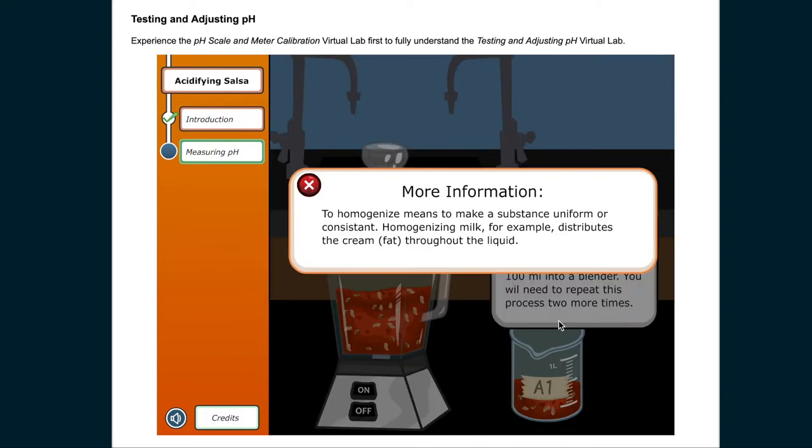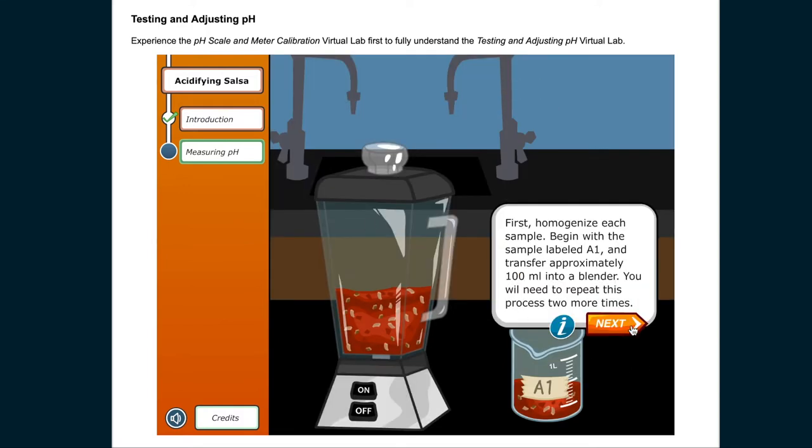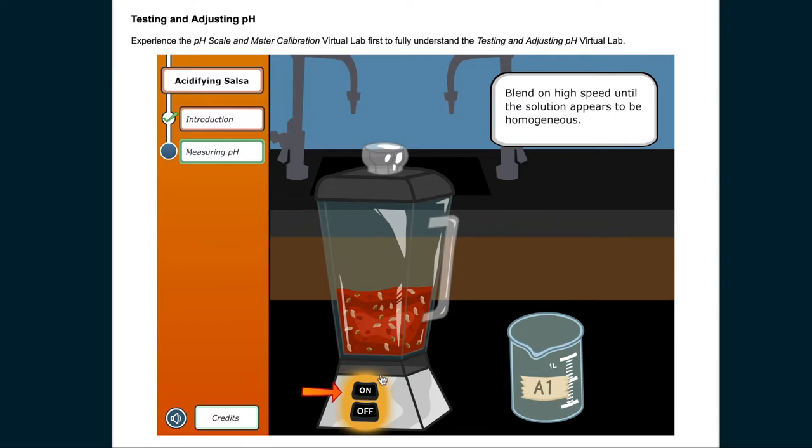To homogenize means to make a substance uniform or consistent. Homogenizing milk, for example, distributes the cream or fat throughout the liquid. Blend on high speed until the solution appears to be homogenous.